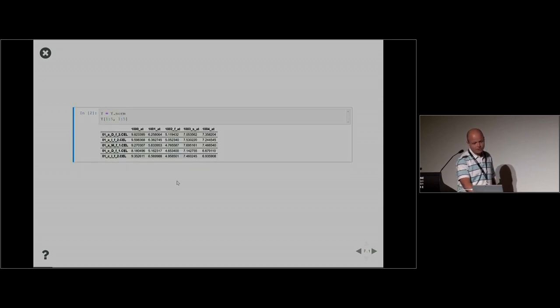Okay, so I'm going to look here at the version of the gene expression data that has been normalized by RMA. I'm going to call that Y. And here is just a subset of it, what it looks like. The columns are genes. Again, this is just a subset, but there are 12,600 columns for the 12,600 genes. And then there are 90 rows for the 90 microarrays. Again, 30 tissue samples, each done at 3 different labs.